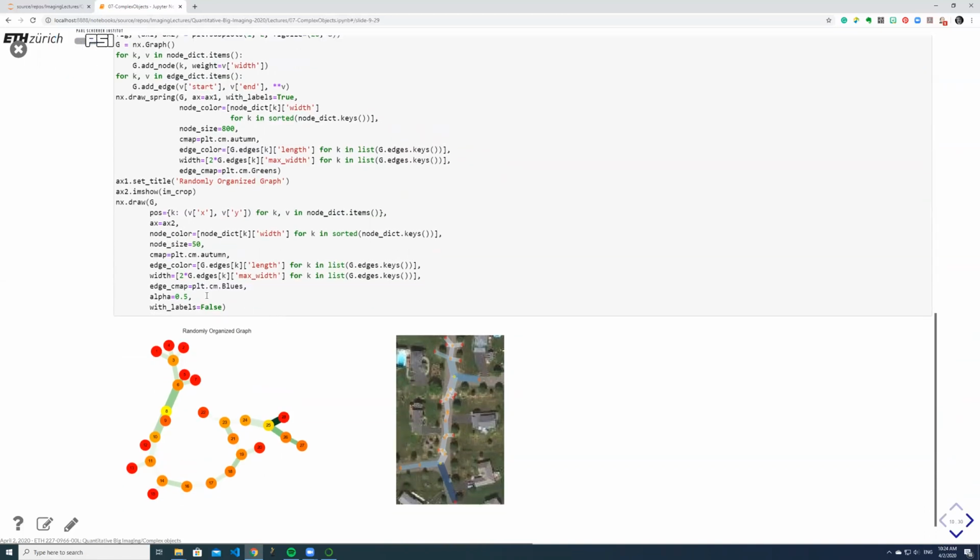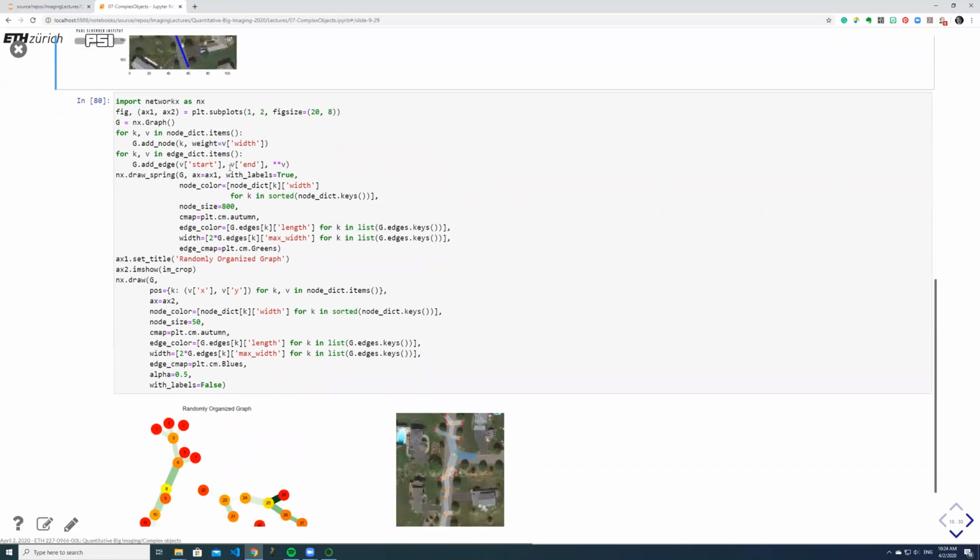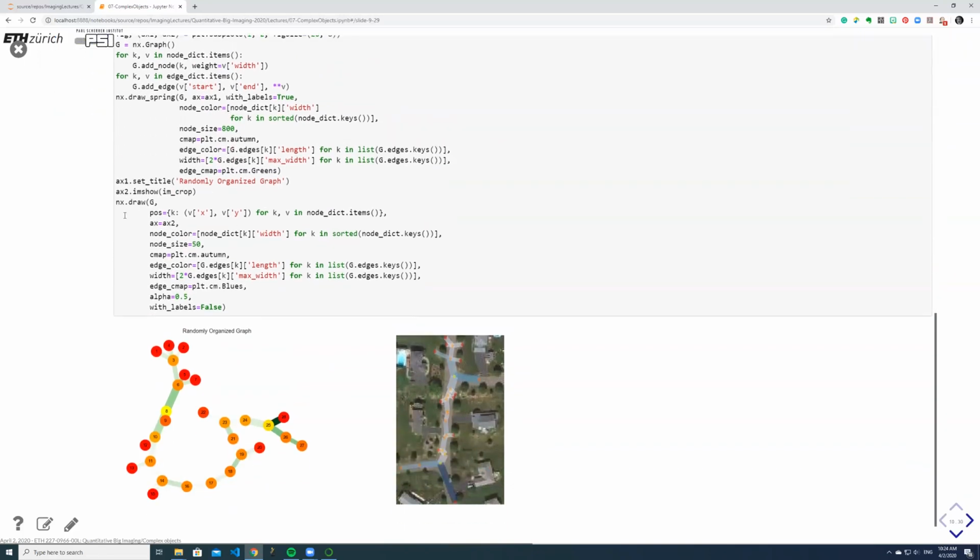To check again. Where is the alpha? It's always the same. It must be that one. I don't find it. That's also typical. That's about the width of the street. So you can tell here about how wide the segmentation is. So apparently these parts are wider than these, and so on. So you can do a lot of color coding, which makes it possible to get visual feedback when you're doing the analysis. And also it's easier to discuss around something when you have this visual feedback.